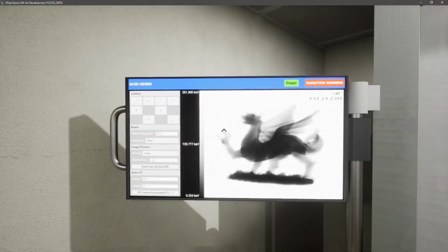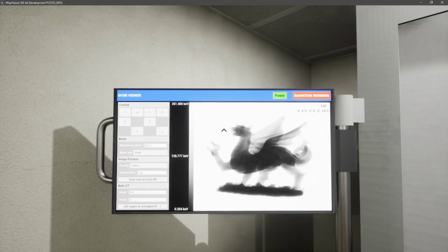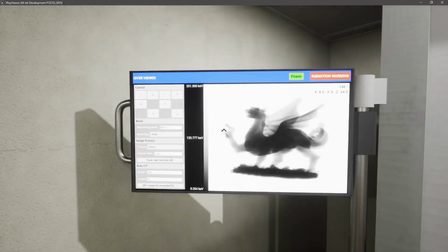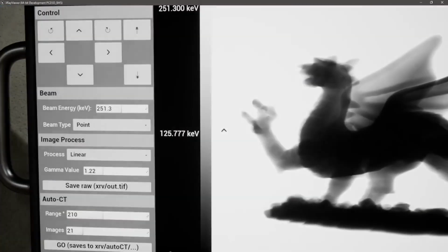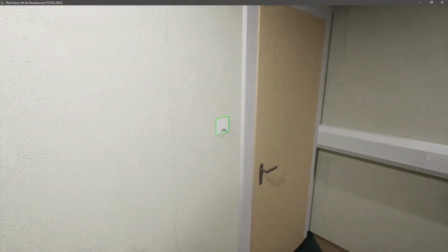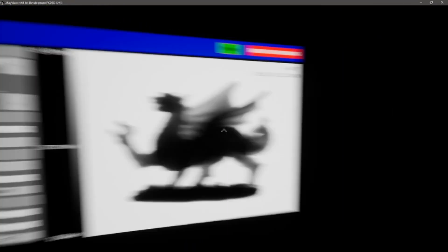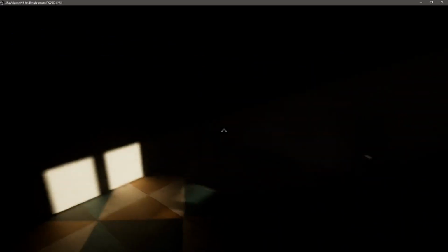There are in the works some keyboard shortcuts for moving samples around, because it can be a bit difficult to look here to see the changes in real time. But for now, this is what is provided, and obviously the environment is also provided with a nice light switch over here, if you are one of those researchers that likes to work in the dark. And I've now got to turn it back on and I can't see it.